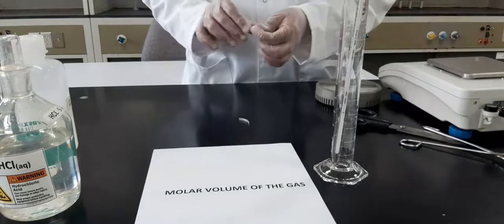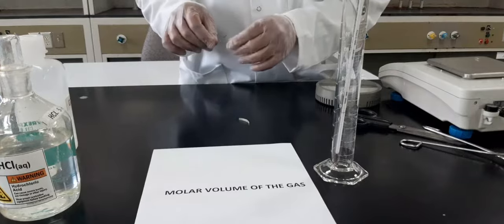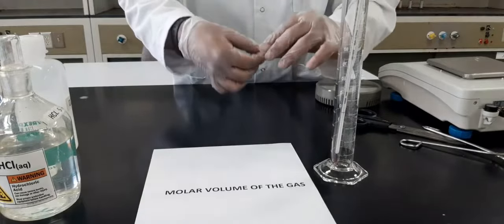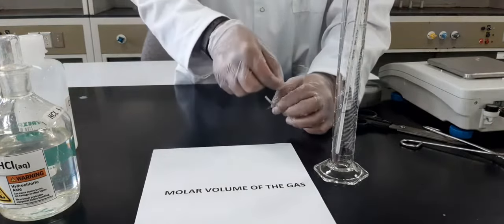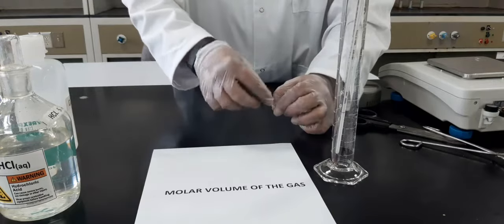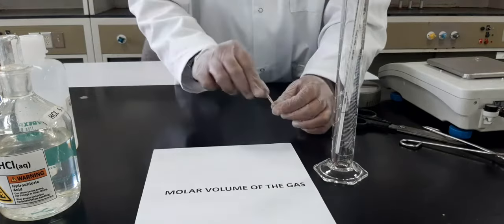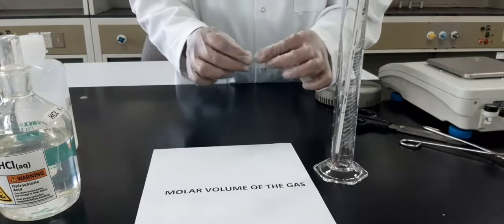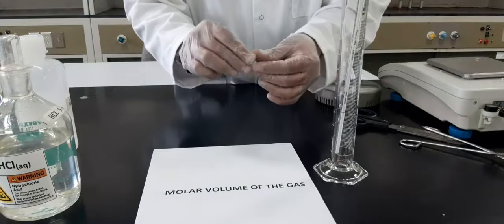This one, we are going to use copper to hold the magnesium down during the reaction. Otherwise, magnesium will lift up. Here we go. I just took the copper and wrapped it around the piece of magnesium, to make sure that copper holds the magnesium while the reaction is going on. It looks like this now. Now I will fold it up a little bit like that, kind of a ring.